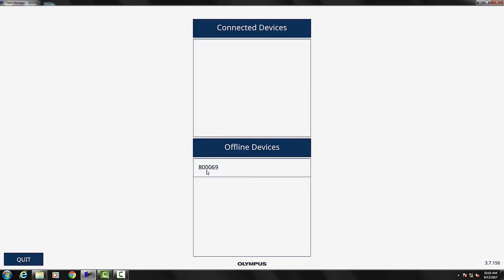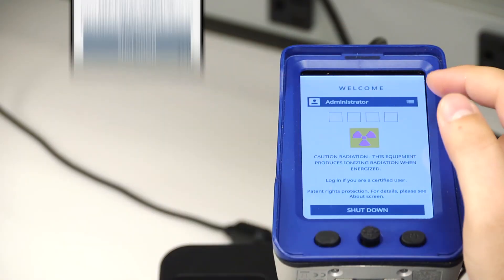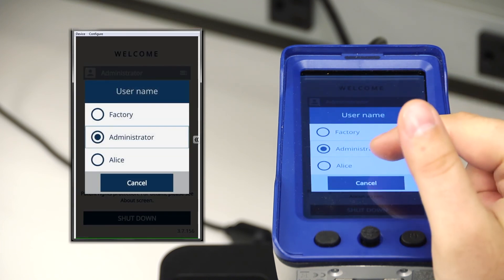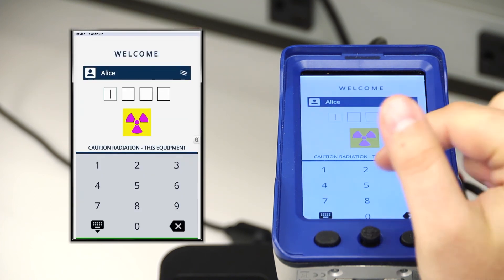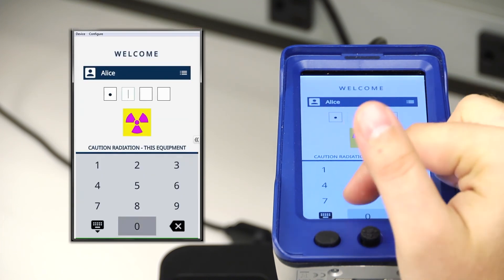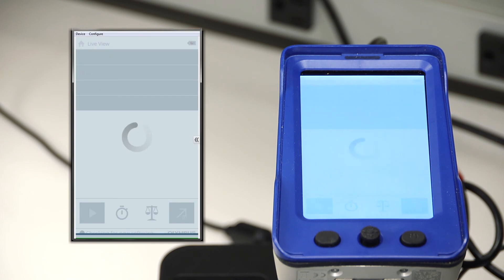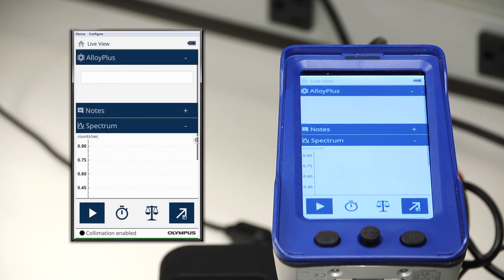Now that we've deployed our new user, we are ready for Alice to log in and start using the Vanta. You can access her login through the login screen in the drop-down menu. Select the option for Alice, log in, and that's it. Alice is ready to go and start using Vanta. That's how easy it is to create a new user profile and deploy it onto your instrument. Thank you.